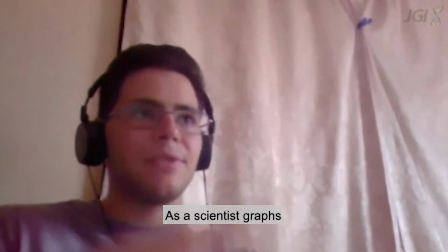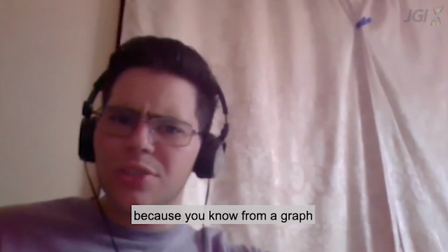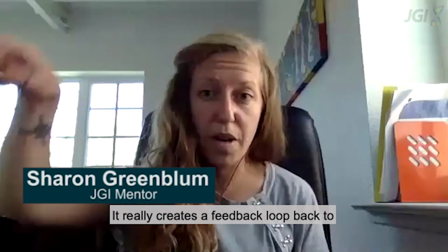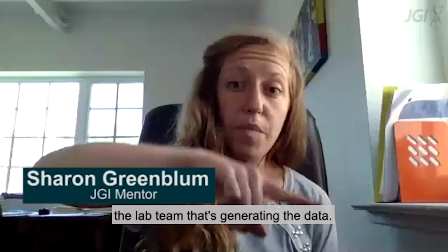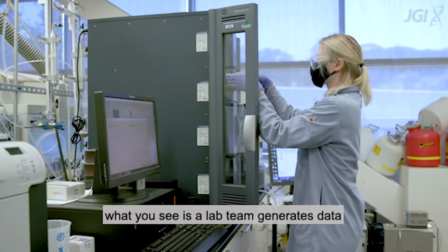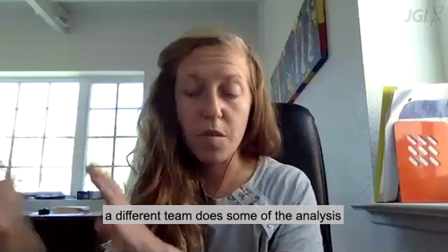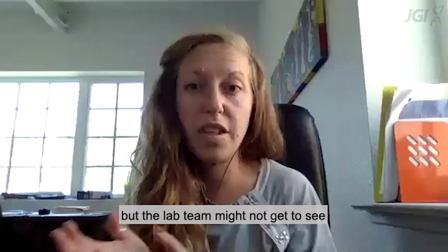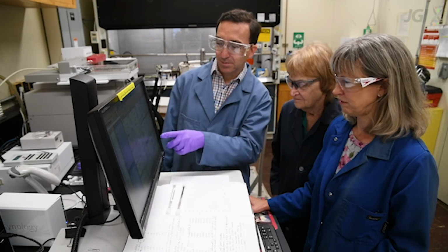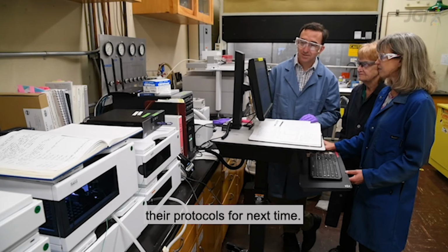As a scientist, graphs, any type of visualization, gives you a lot of empowerment because from a graph, a story can be told. It really creates a feedback loop back to the lab team that's generating the data. A lot of the time, what you see is a lab team generate data from sequencing, and then a different team does some of the analysis, and then it goes forward. But the lab team might not get to see what the quality was and how these results turned out, and then be able to make tweaks to improve their protocols for next time.